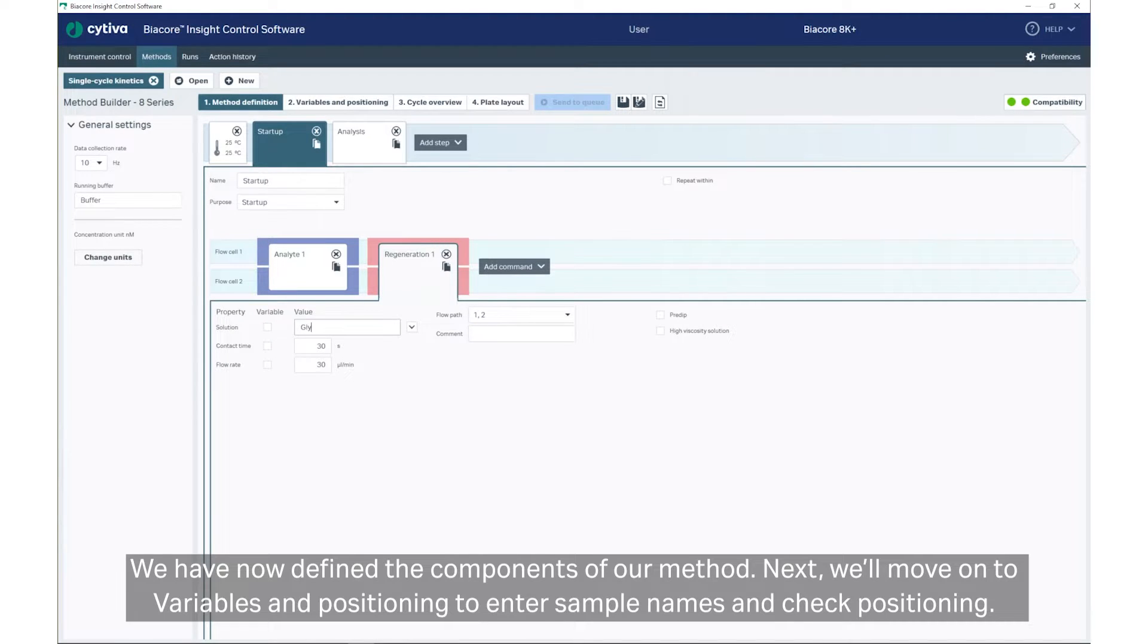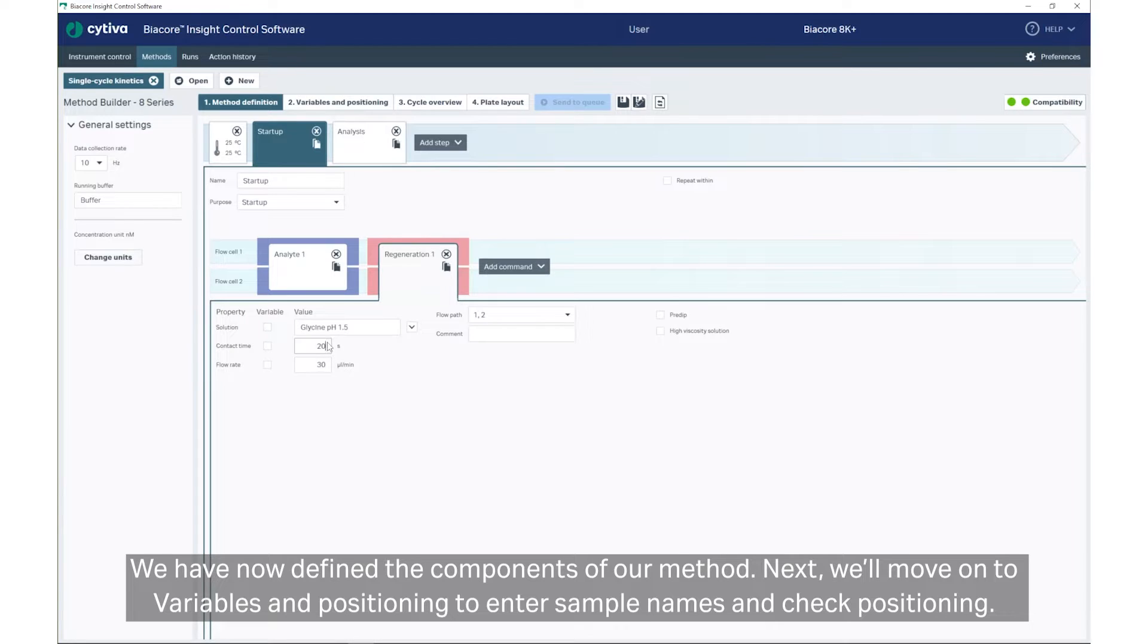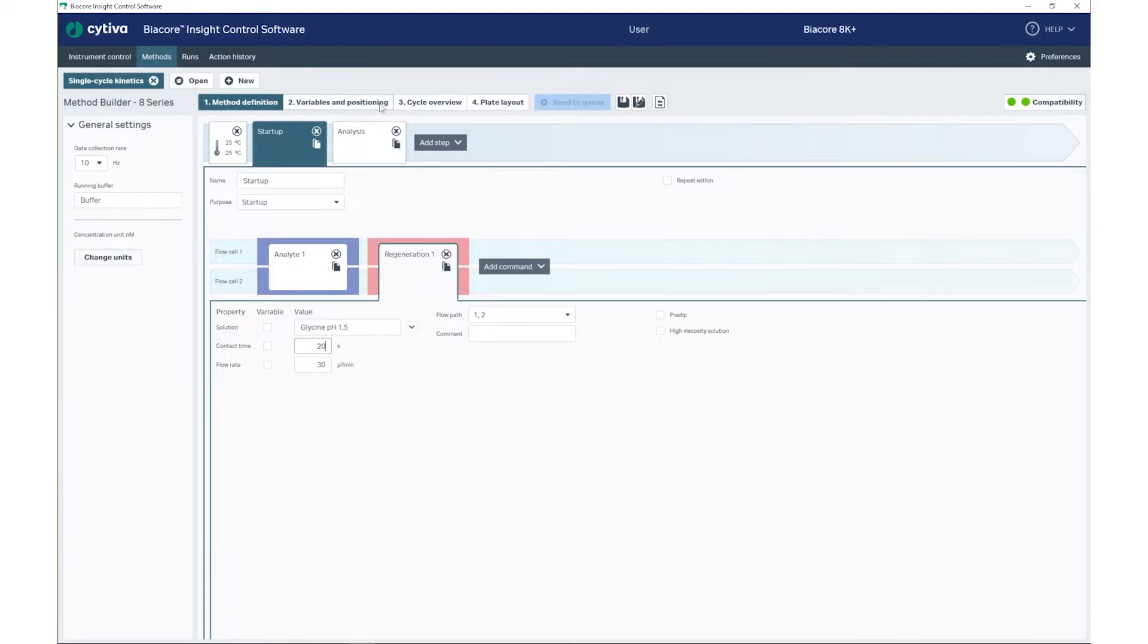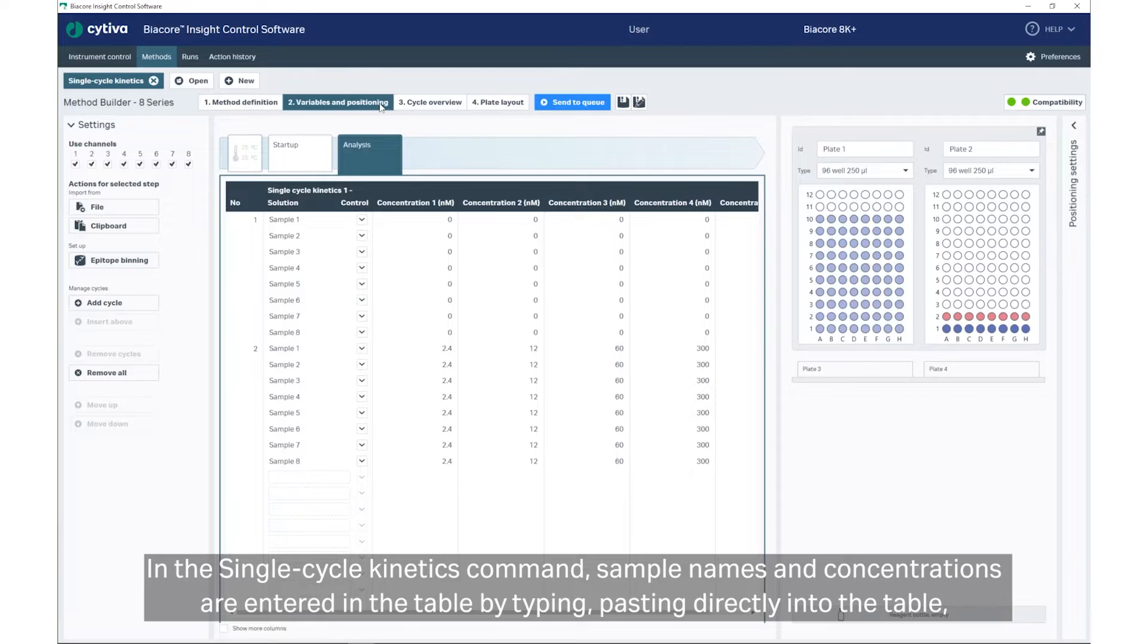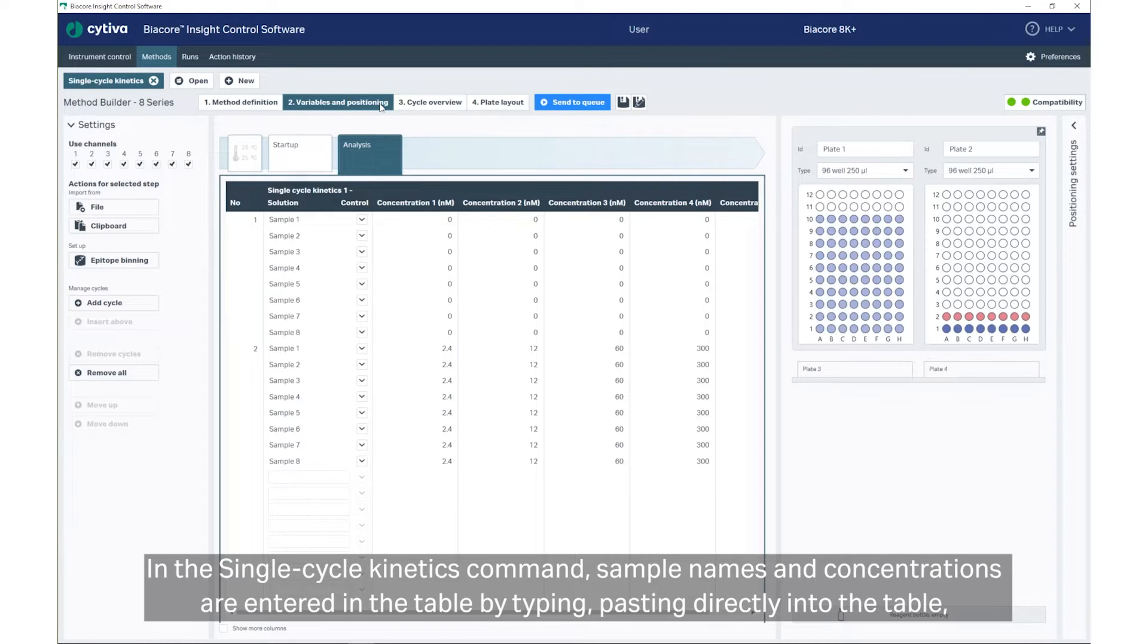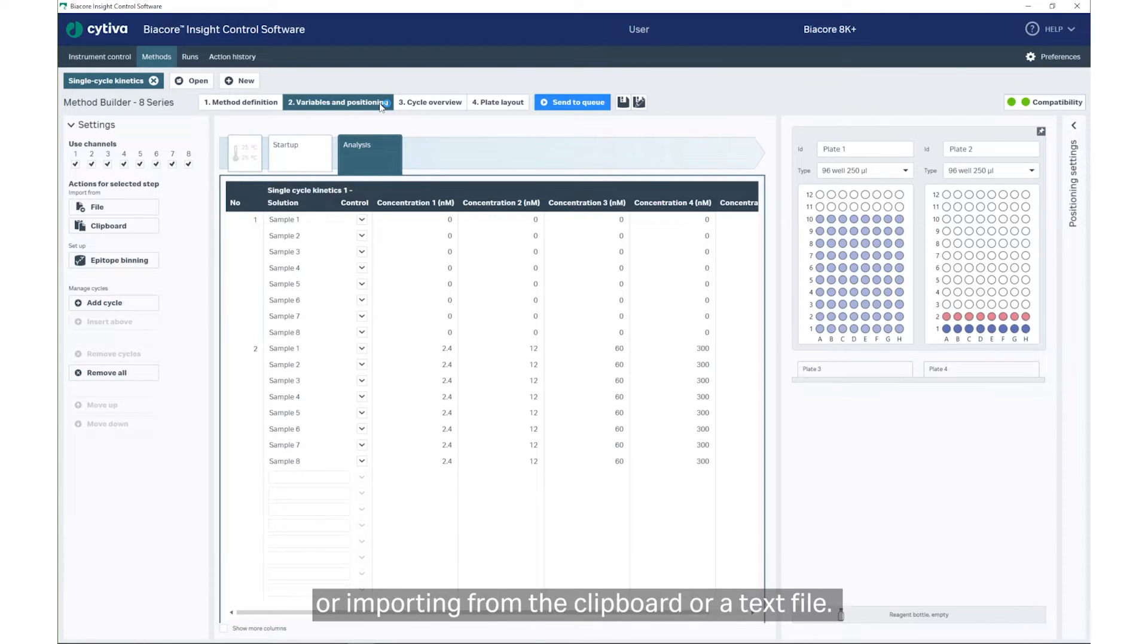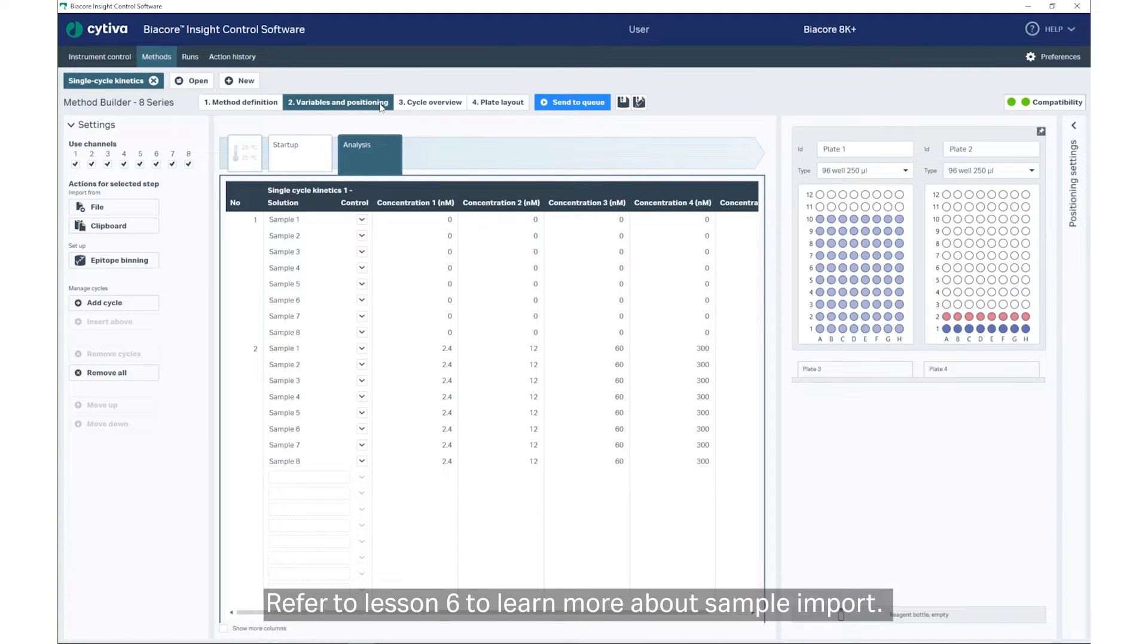We have now defined the components of our method. Next, we'll move on to Variables and Positioning to enter sample names and check positioning. In the Single Cycle Kinetics command, sample names and concentrations are entered in the table by typing, pasting directly into the table, or importing from the clipboard or a text file. Refer to Lesson 6 to learn more about sample import.